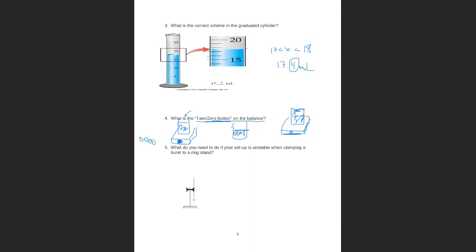So you have to remember those three steps. First, you put the empty container, can be a beaker, or wherever you are going to weigh. Then you zero, and then you add whatever you want to weigh. You add your sample to the glassware and record your mass. Sometimes we use little plastic boats. So first you place the boat on the balance, you tare the function, like you zero, then you add your sample and take the weight. Okay, so that is important, even though you are not in the lab. You need to be familiar.